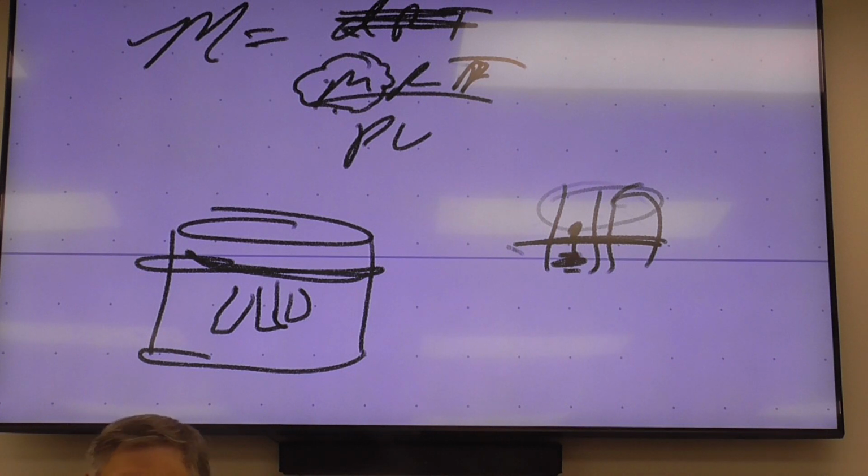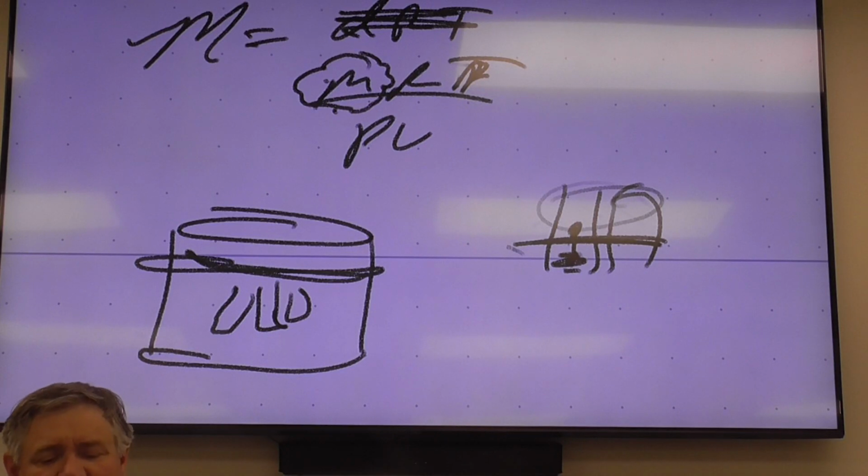So in the procedure, it says to do this for like 5 minutes. If you can look and see that most of it, you're not going to get all of it to boil, but you should be able to get the vast majority of it boiled off.